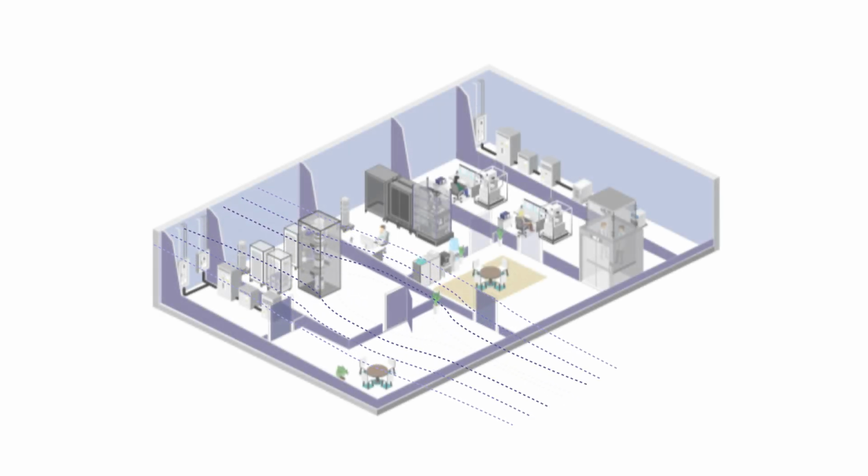When you're talking about DC magnetic field sources inside the laboratory itself, you're almost always talking about the movement of large ferromagnetic objects, and that's steel doors. So that's steel doors to the laboratory, steel doors to the chase, steel doors in the hallway outside the laboratory. Because these doors are large and steel, when they open and shut, they cause Earth's magnetic field lines to bend. They're in relatively close proximity to the column, and so it results in a beam shift, which is problematic. It results in image distortion and bad data.